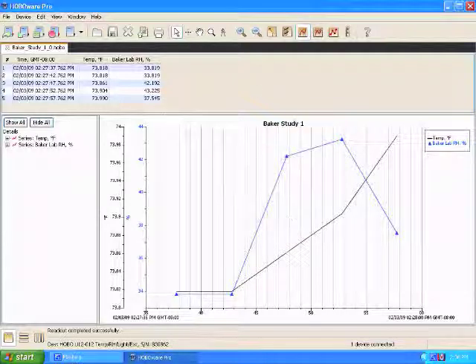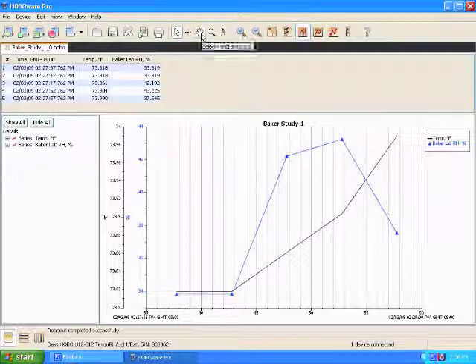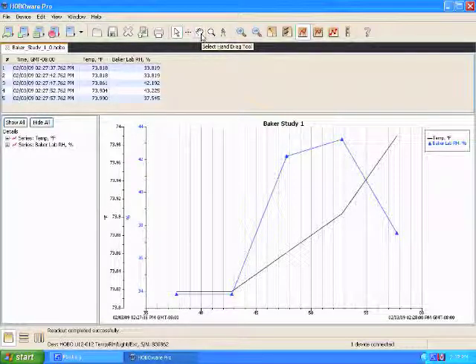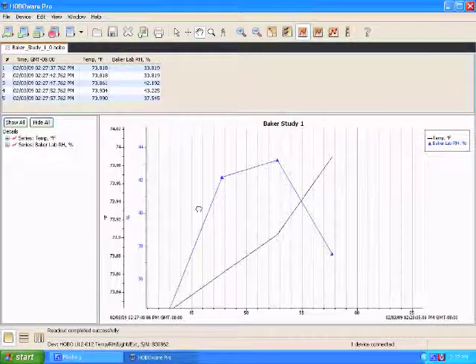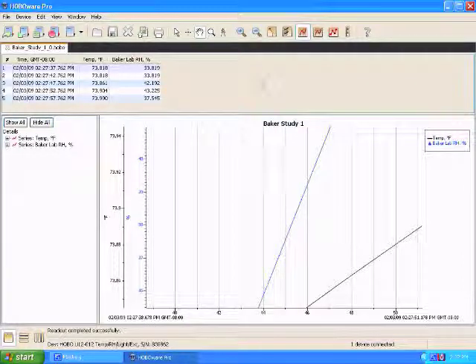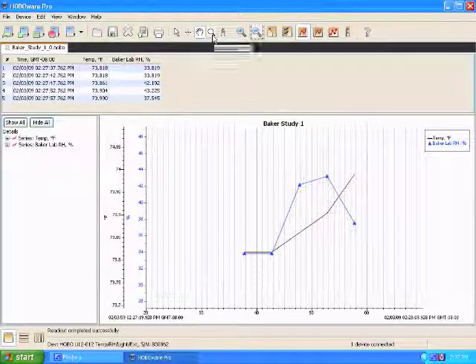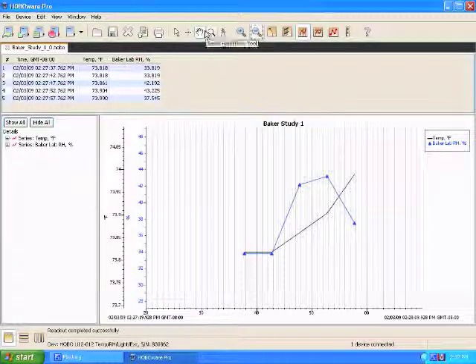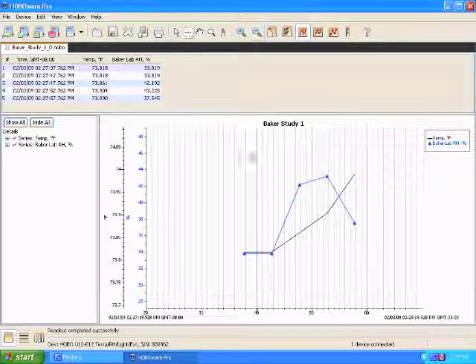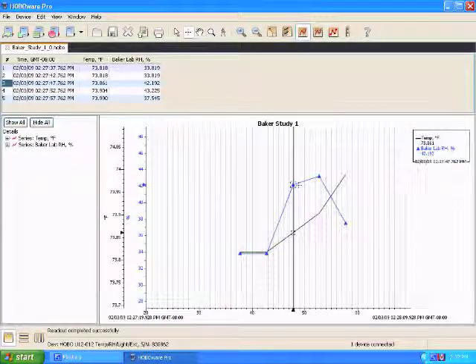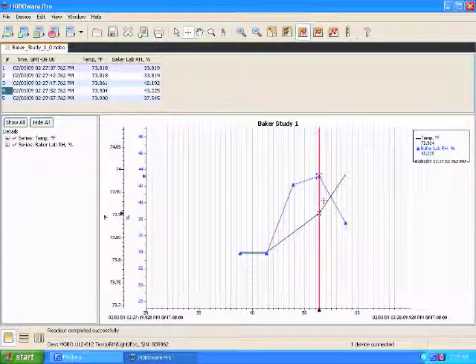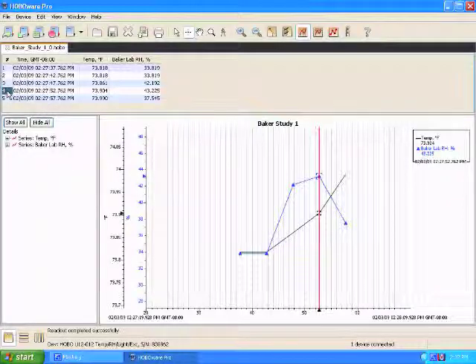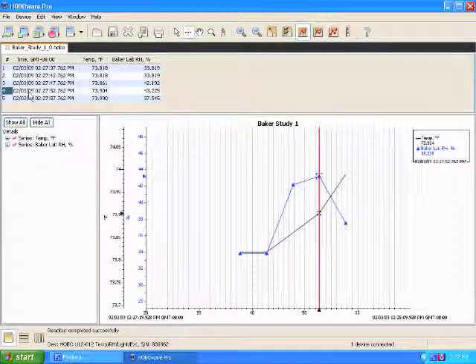Basic navigation tools in here are very similar to a lot of other Microsoft Word programs. You have the hand for dragging your chart around and selecting which part you want to look at. You have the zoom in and zoom out tools. You also have the select crosshair tool, which will allow you to, if you want to click on this point, it will allow you to select a specific part of the chart. And you can see also right now that I've got the fourth data point selected and it's brought it up on this little table. Okay, here is the fourth data point. Here's when it was collected. Here's what temperature it was.